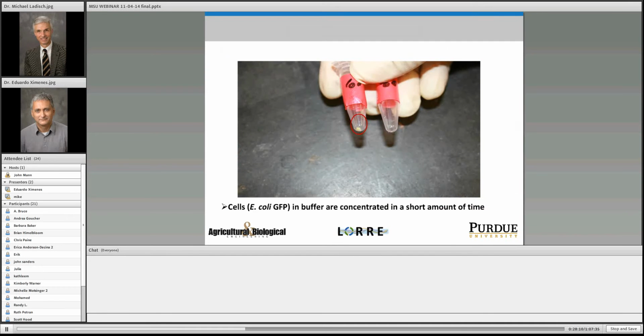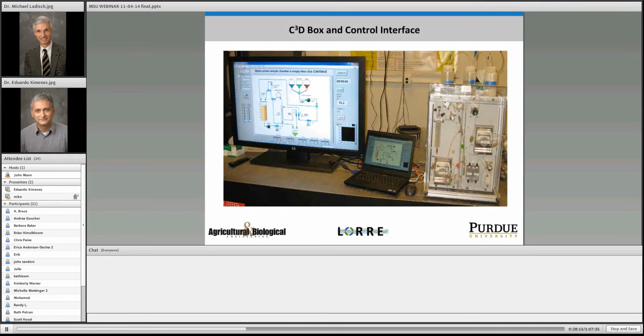At this point we learned how to control the system in order to be able to reuse the microfiltration hollow fiber membrane at least 15 times. And automated operation is critical to achieving this result. And again, the hollow fiber membrane itself is shown. It's sort of a green tag in the middle of the picture of the instrument. On the right of your PowerPoint, the two boxes are pumps, and then we also had some connecting tubing and valves in this system.